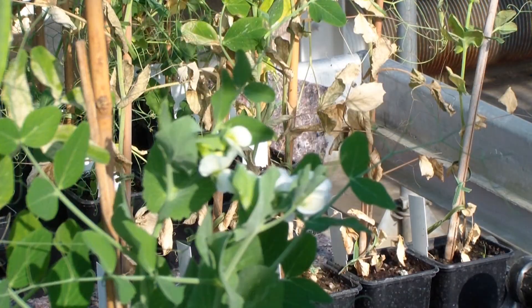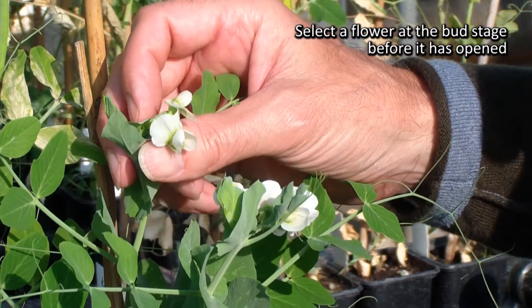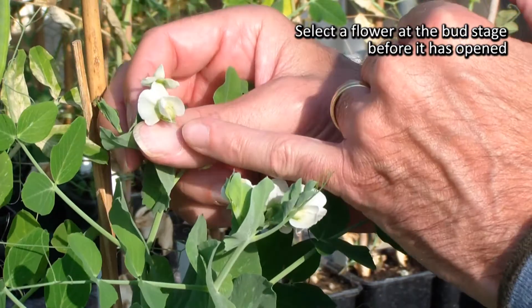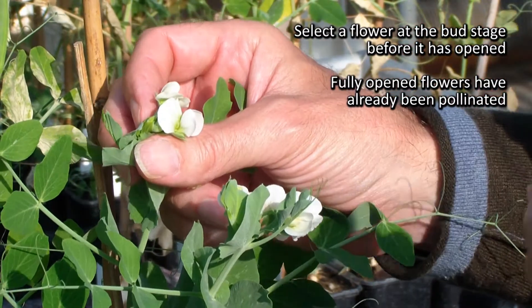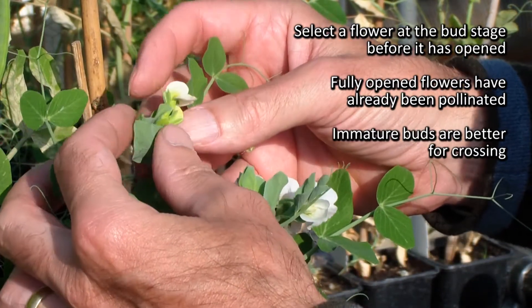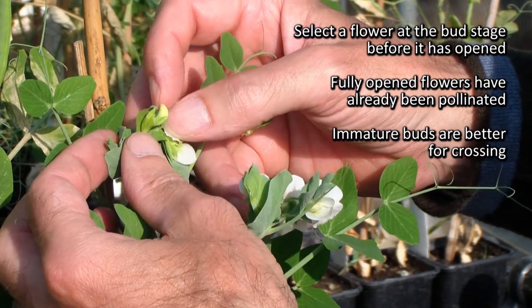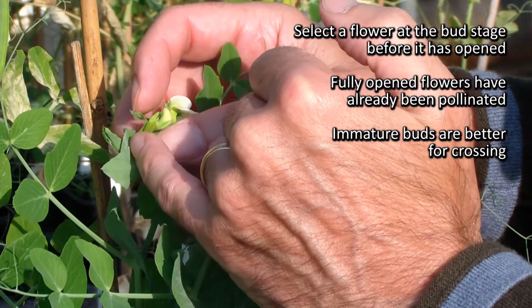The first thing you need to do is to select a flower at the right stage. What we're looking for is a flower at the bud stage before it's actually opened. By the time the flowers are fully opened, the flower is already pollinated and that's no use. In here we have earlier, more immature buds. This one is at the bud stage and should be a good candidate for crossing.